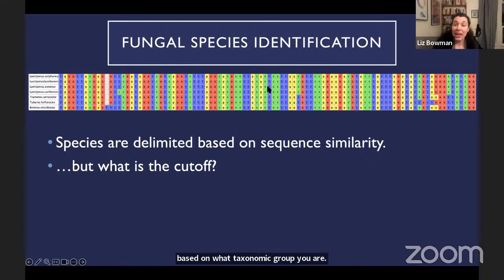So this is something that you can do if you want to. If you have a new species that you're trying to define, if you're trying to determine if it is a new species or is it the same as another, you can compare the sequences and try and figure out whether it's different or not.